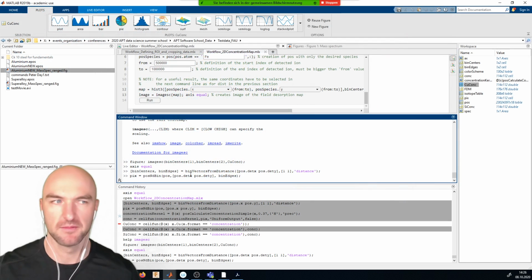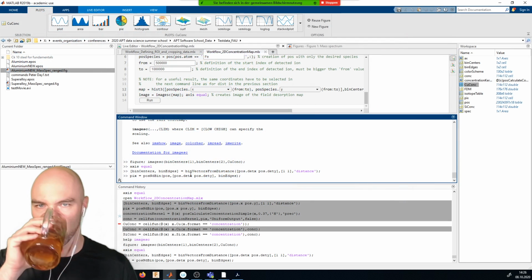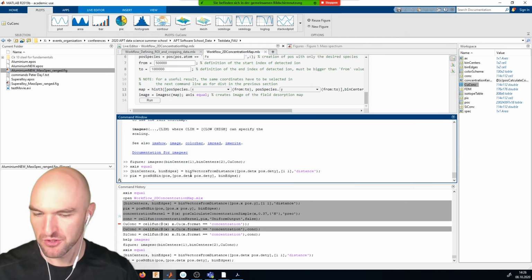Oh, sorry, still on the wrong. It's on the wrong screen now.